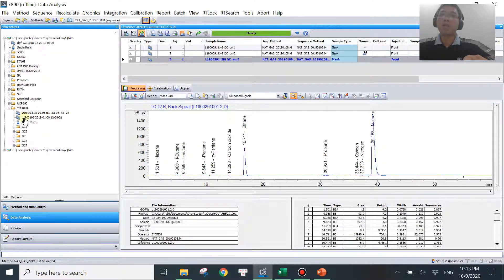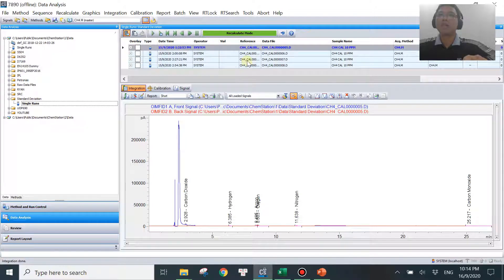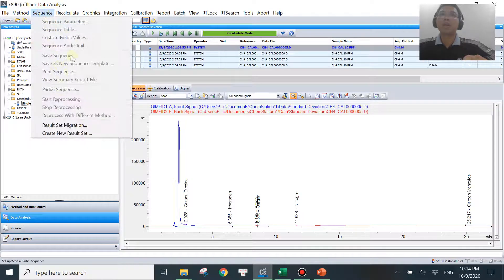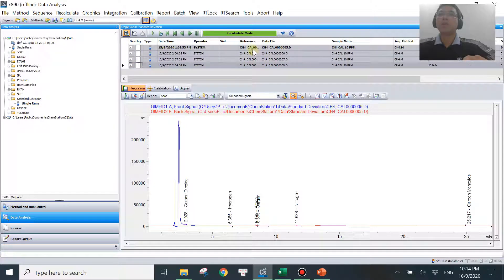The second scenario is when you didn't run your data by sequence and instead ran by single run. When you open single runs your data will show up, but certain icons are not available and some sequence menu options are greyed out, so you can't do reprocessing the same way. What you need to do is select the data you want to include in your calculation — let's say all four of them — highlight and select all of them, then go to Sequence.